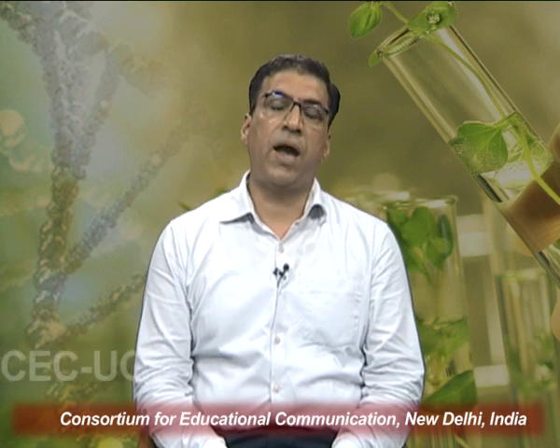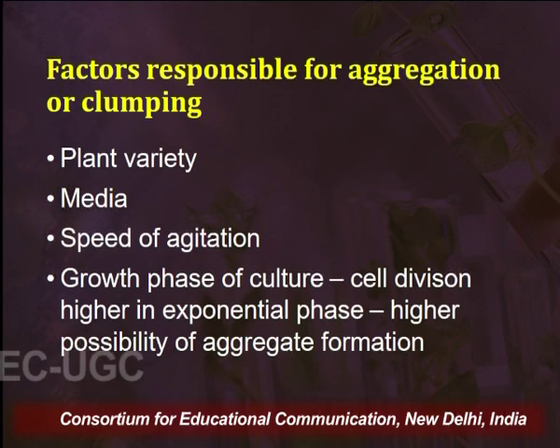Now, what are the various factors that are responsible for the aggregation or clumping of the cells in the liquid media? First is the plant variety.